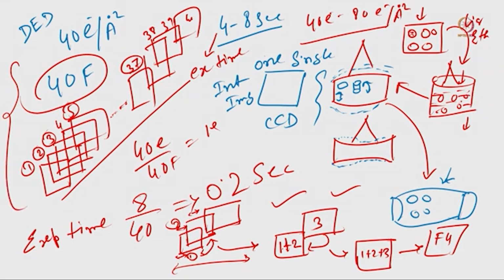First we will get the data, and then what is next? The next step is to correct the motion of the individual frames, correct the drift first, and get a better image. Let us take a look at how this actually looks.